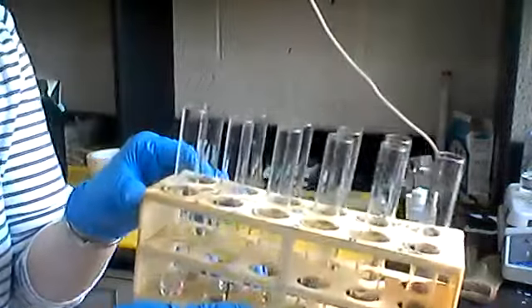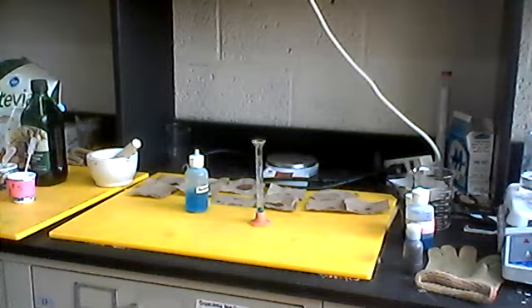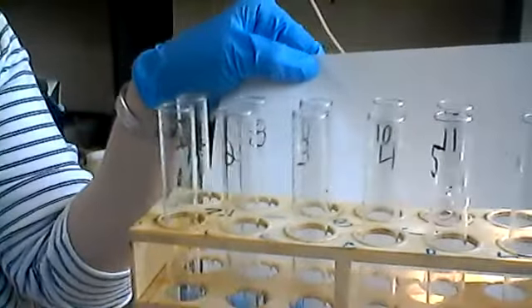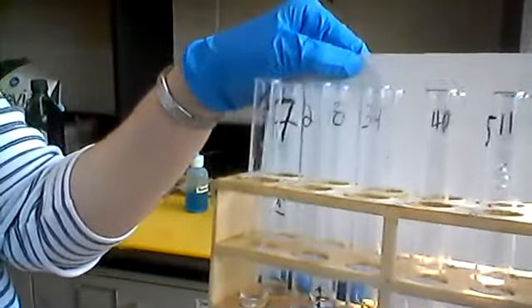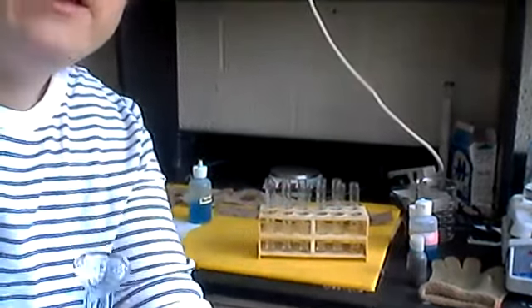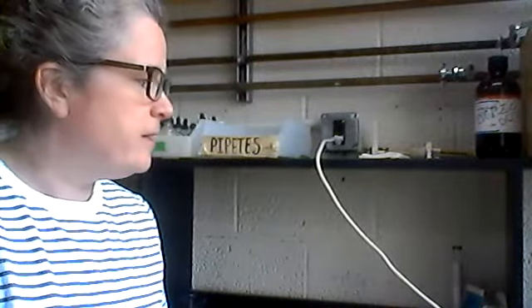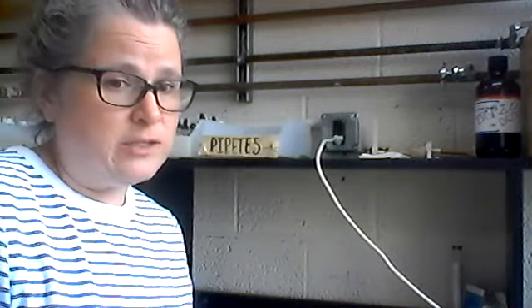So you can see that I've numbered them. Maybe let me get a piece of paper. I've numbered them each. So number 1 is water, 2 is glucose, 3 is sucrose, etc. And then to each of those, I'm just going to add this Barfoed's reagent. And then I'll take some photos of what that looks like after I add the reagent, and then we'll put them in the boiling water bath, and we'll heat them for 10 minutes to see the reaction.